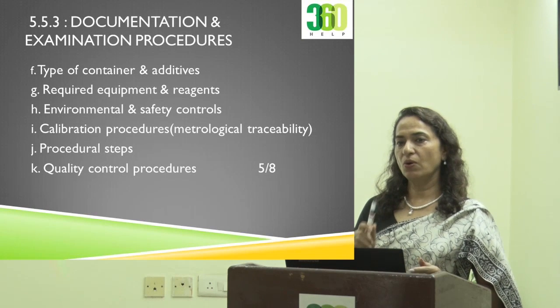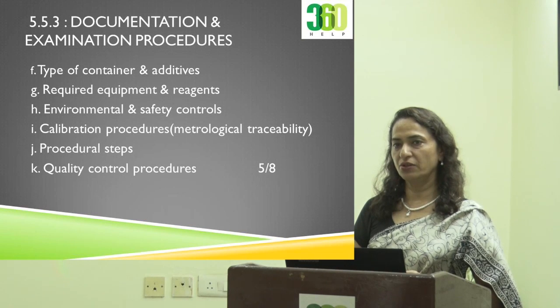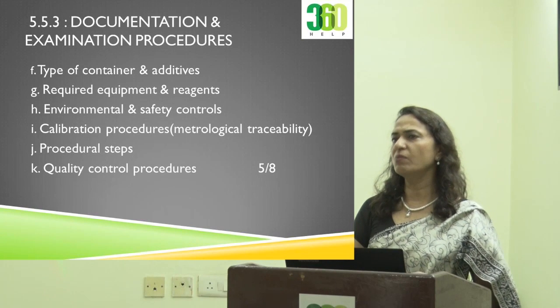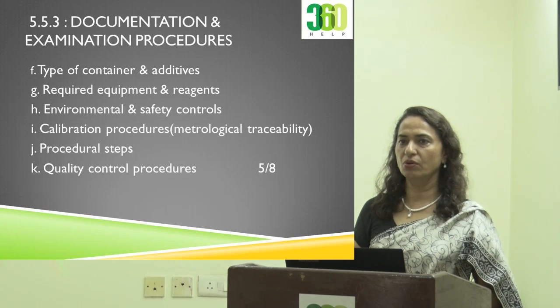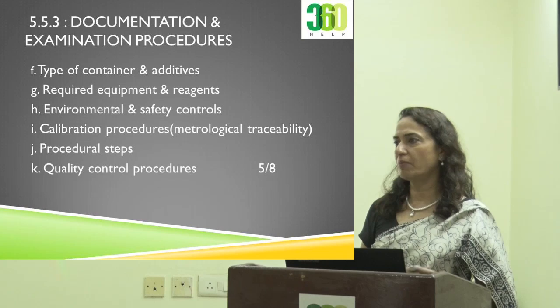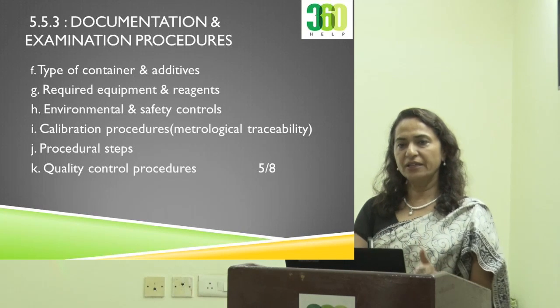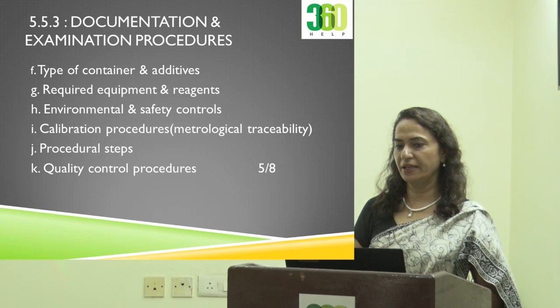If you see, all these things are given in your kit inserts. Kit inserts have all these things, but if you are creating your own SOPs, they become more uniform under the same heading, so your people find it easy to go through and implement, because otherwise every kit insert has a different format. Information you can take from the insert, from a textbook, you can mix and match, but the standard has given you the headings under which you should be writing an SOP.